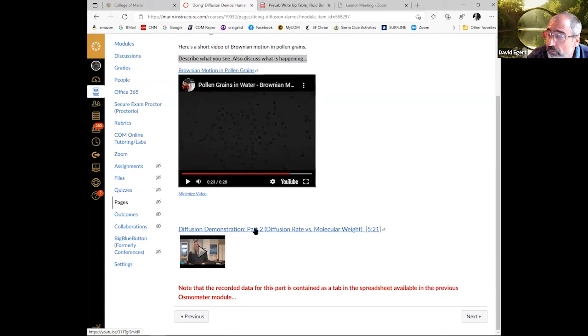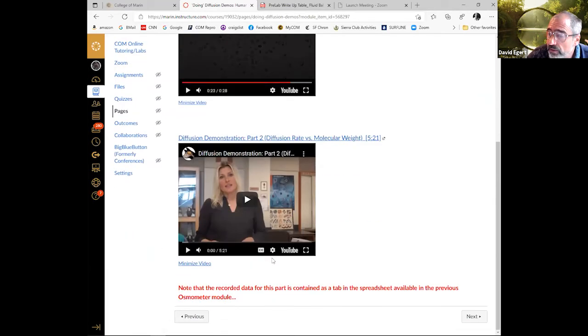The other part here, part 2, I talked about last time how molecular weight can affect diffusion rate, that if things weigh more, they have lower velocities for the same amount of energy, so they tend to diffuse slower. So this is a little 5-minute thing where Tina will guide you through the little experiment.